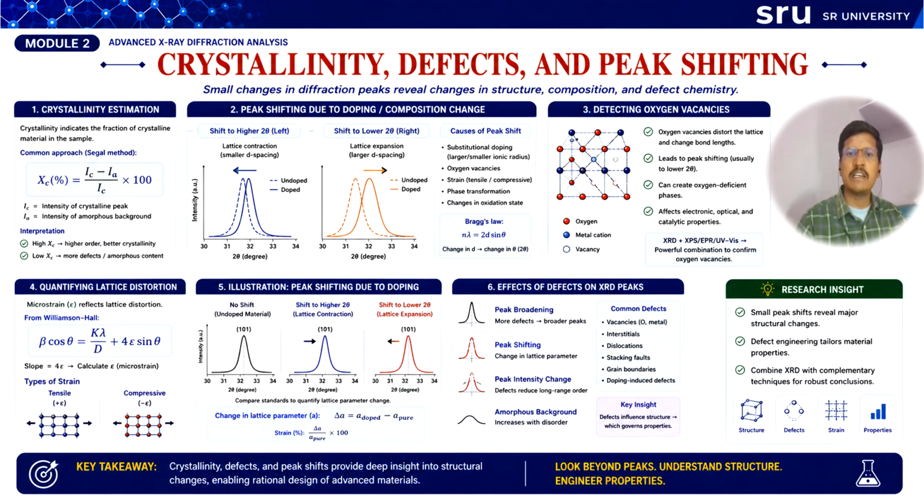Grain boundaries or dopant incorporation may be a cause of the lattice distortion. Thermal mismatch or crystal defects are also reasons for this lattice distortion.